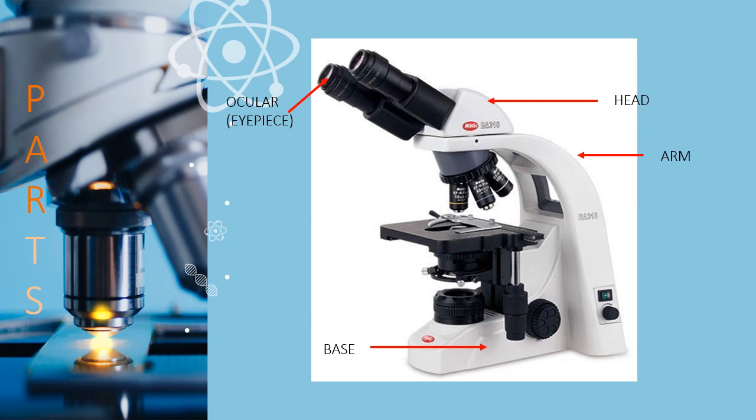The eyepiece is the lens nearest to your eyes. This is the interpupillary adjustment to adjust the distance of the eyepieces. This is the nose piece, the circular structure where the different objective lenses are screwed in. To change the magnification power, you simply rotate the turret.